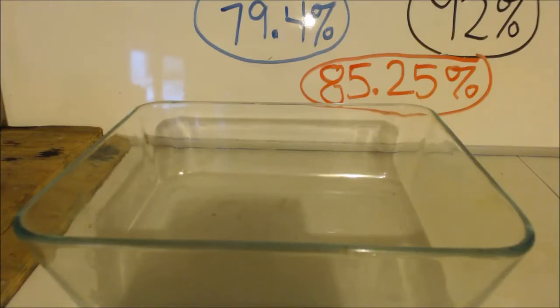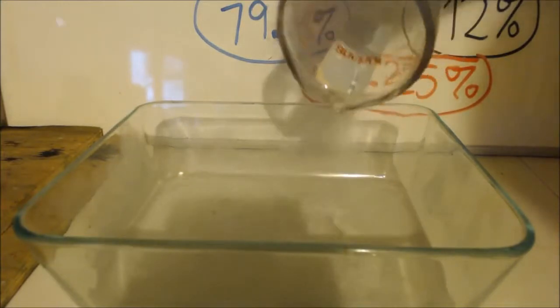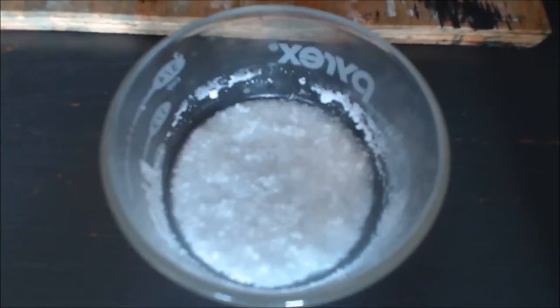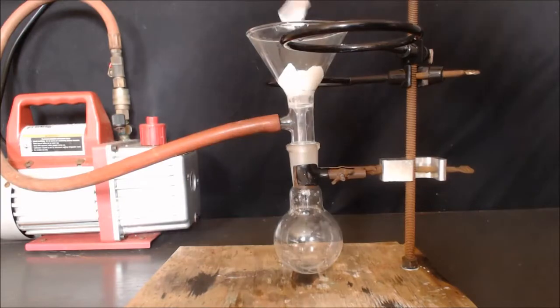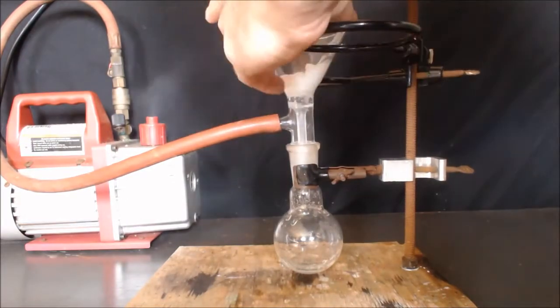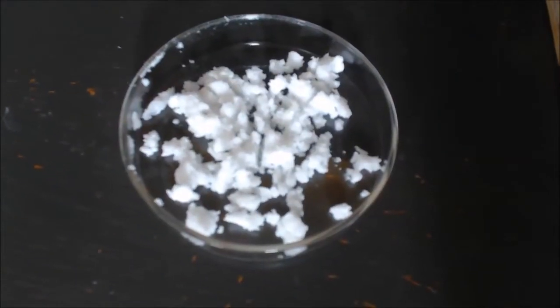Alright, I heated this up. I'm going to pour it in this thing and let it cool down and evaporate. It's nice and hot, has a lot of surface area. It should evaporate within a day or so. Alright, there it is. I'm going to filter out that water. I'm going to leave that on there for a while till it gets dry. As you can see, they're beautiful white crystals.